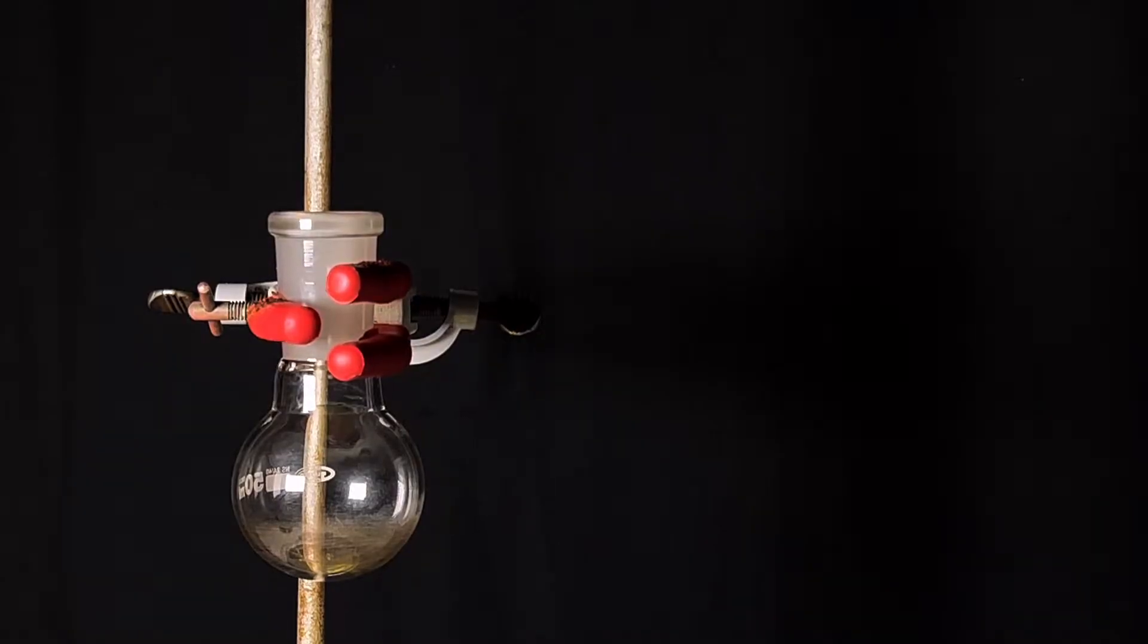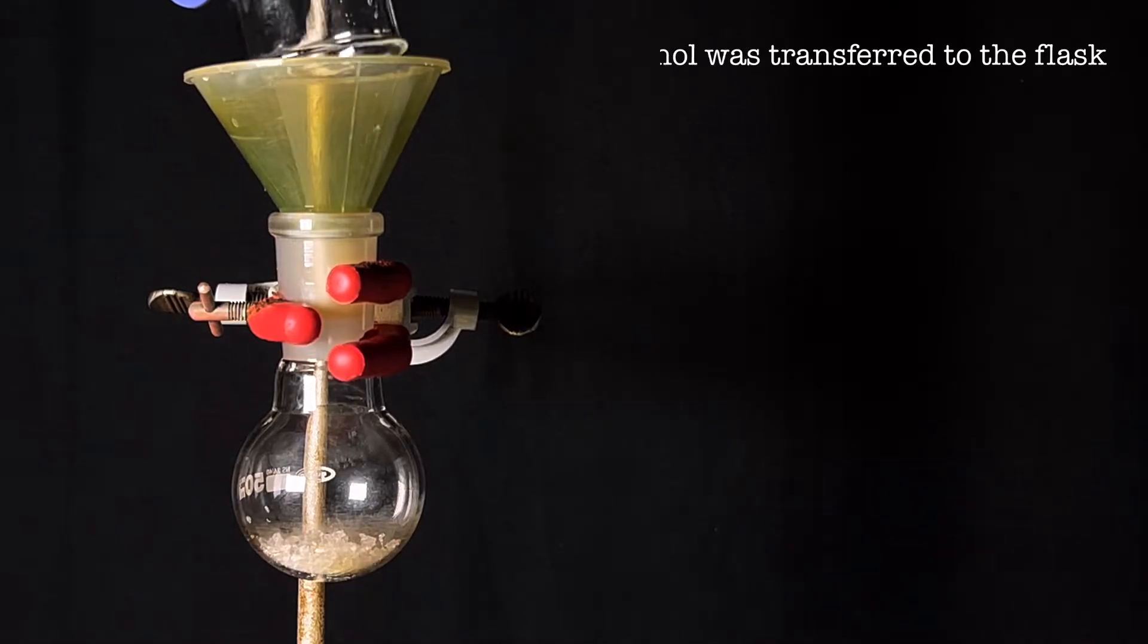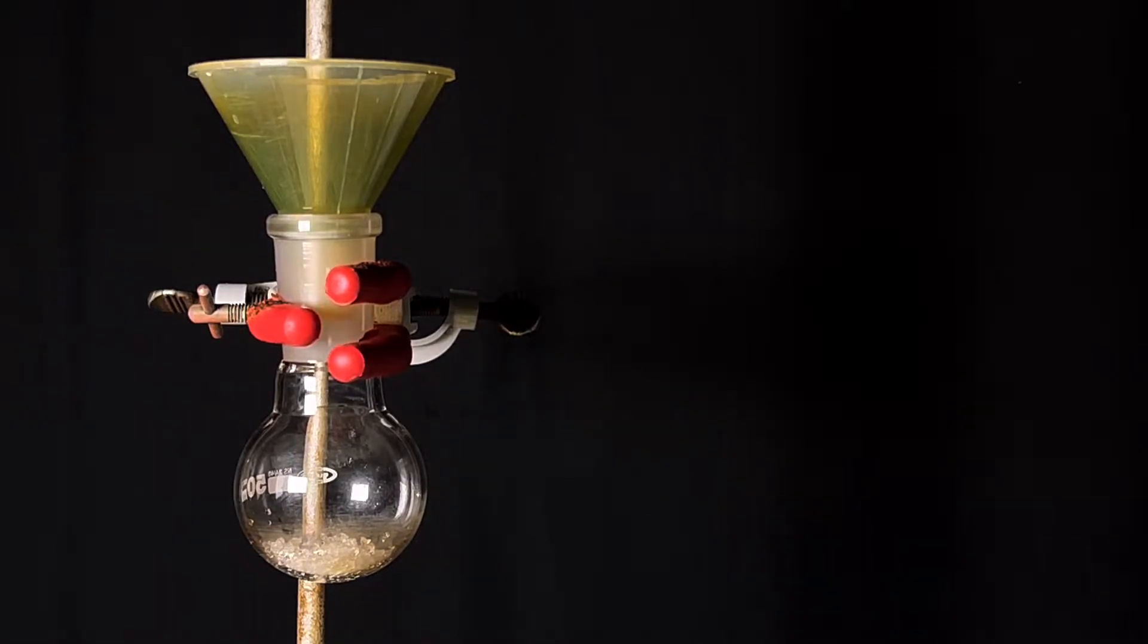Start by fixing a small 50 ml round bottom flask onto an iron stand using a clamp. A small funnel was placed above the round bottom flask and 2 grams of phenol was transferred to the flask. Phenol crystals are extremely corrosive, as a single crystal if it comes in contact with skin for few seconds would cause severe burns.